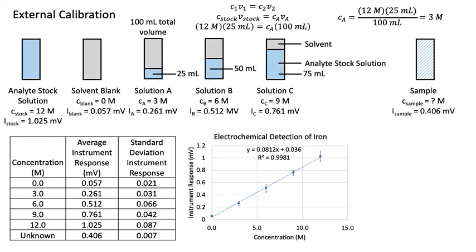This r-squared value will tell me something about how well this linear line fits the data. A value of exactly 1.000 will represent a perfectly linear line. Now this is not perfectly linear, although it is very close. So we have a number that is very close to a value of 1. The lower the number, the worse the fit is to a linear line.